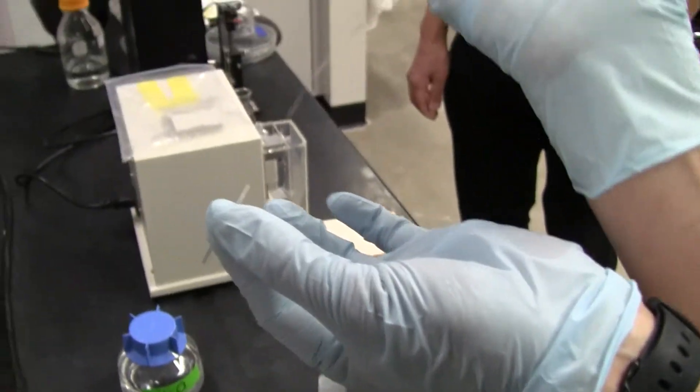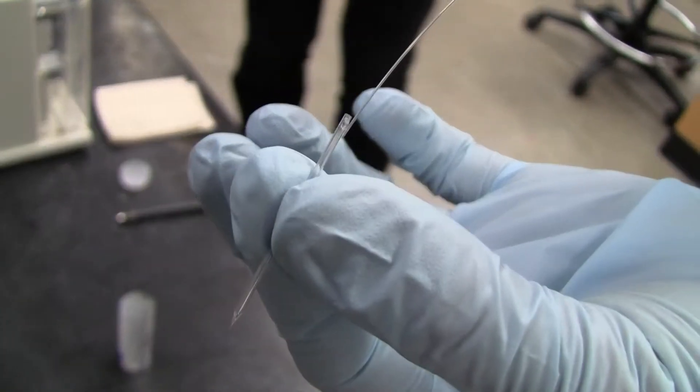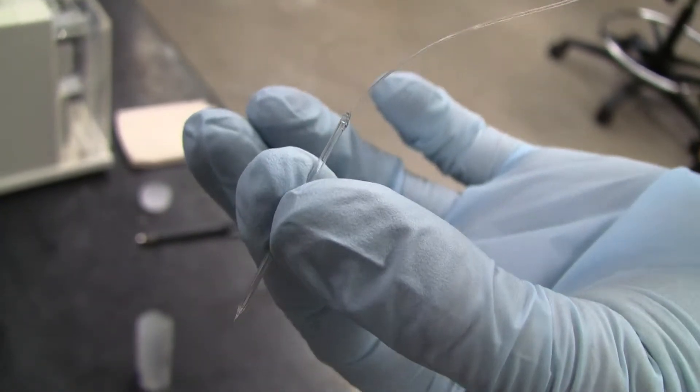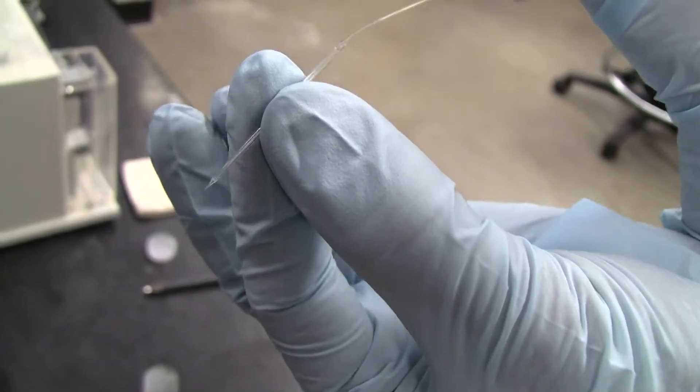Filling the electrode again up to the very, very tip. If I can get in, go, go please. Very, very tip.